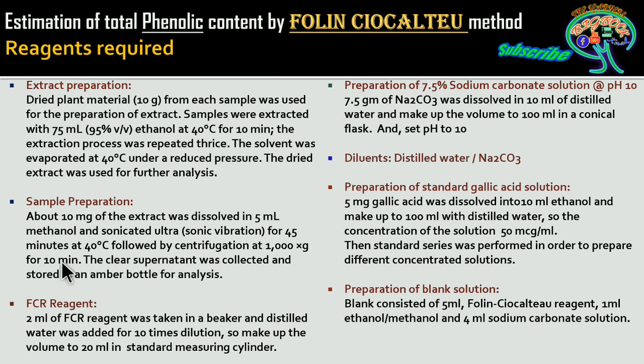Again here we are dissolving the sample in methanol at 40 degrees centigrade, but for a longer time, 45 minutes, followed by centrifugation at 1000 times g for 10 minutes.